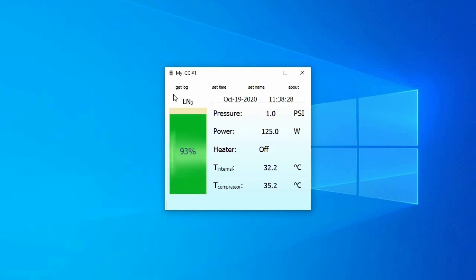Furthermore, if there would be any doubt or concern regarding the correct operation of the unit, the log file can be easily shared with Mirion's service representative, who can further assist you.